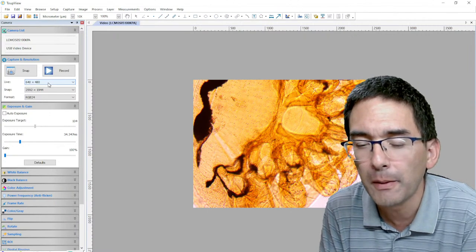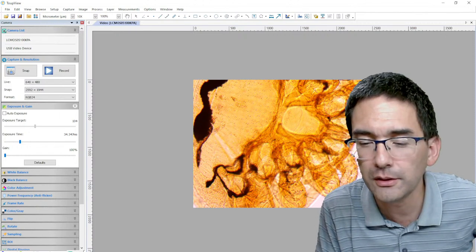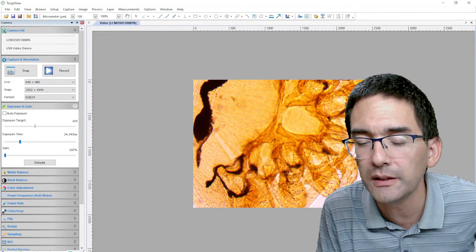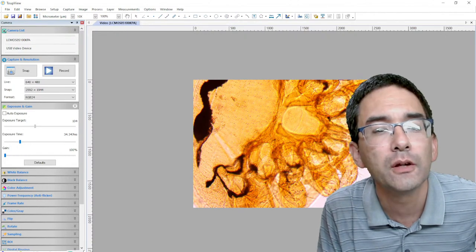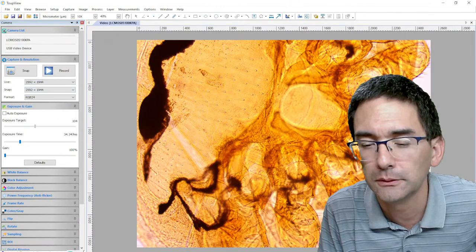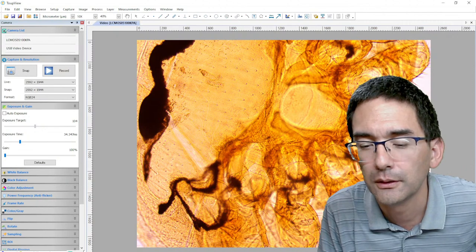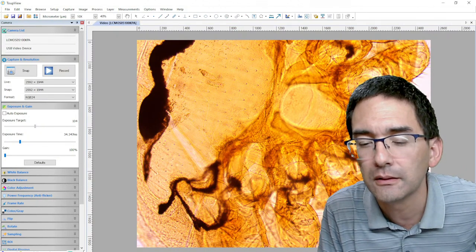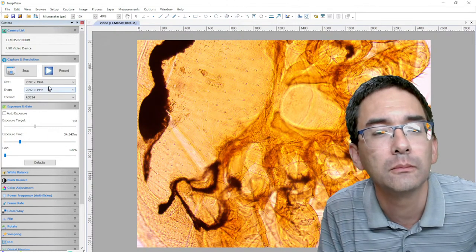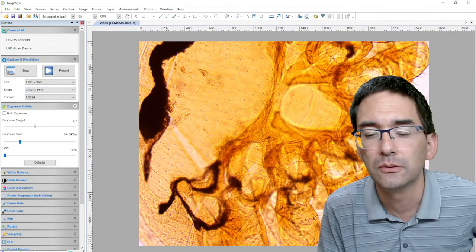By the way, I don't know if you're able to see this down here. Look, all the way down here, there is this information bar, and it says frame rate 29. So I've got now a frame rate of 29, and let's see, if I go all the way up, the frame rate down here drops to 6.8. So the information bar on the very bottom actually tells me the speed.